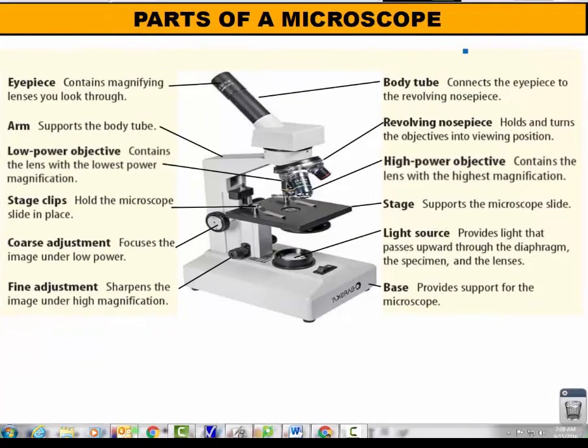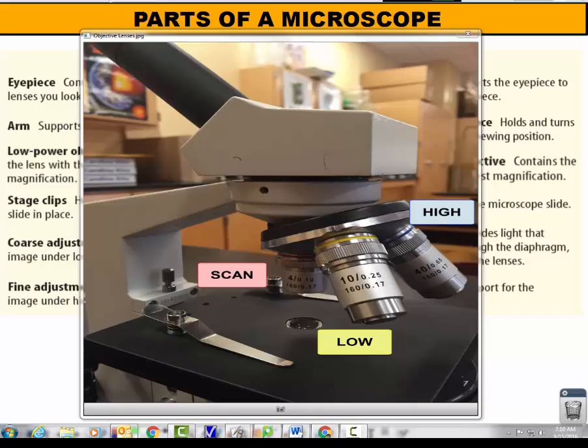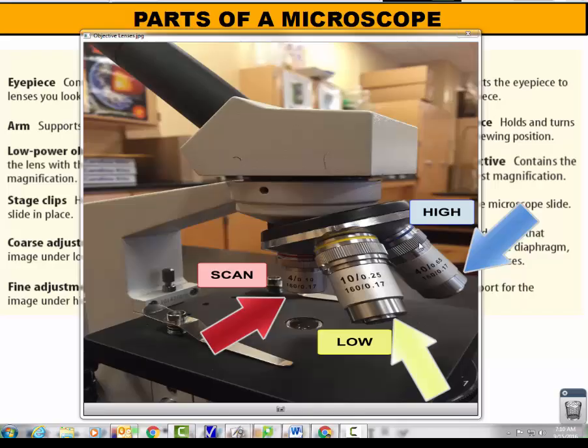So hopefully that was easy enough. Now let's take a look at the three objective lenses that we have on the microscope. If you take a look at the microscope we have three objective lenses with three different colors. We have a red lens, a yellow lens, and a blue lens.